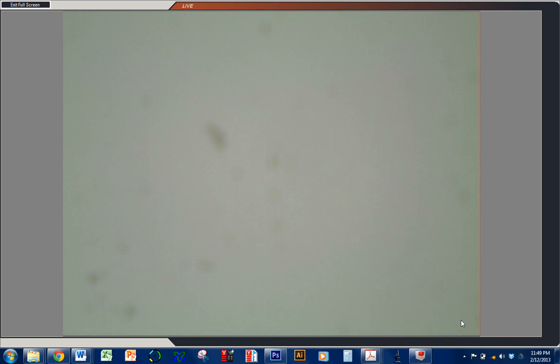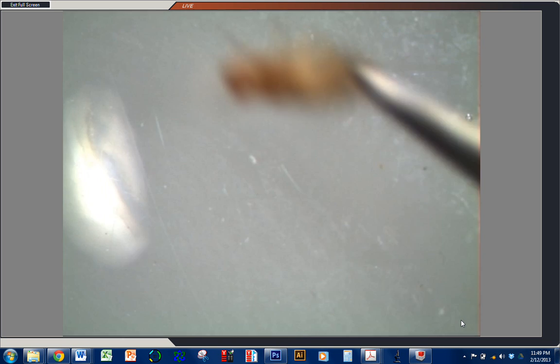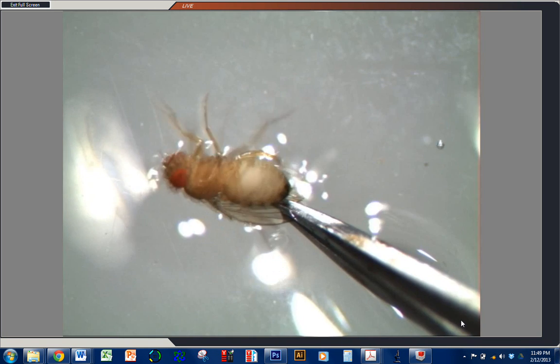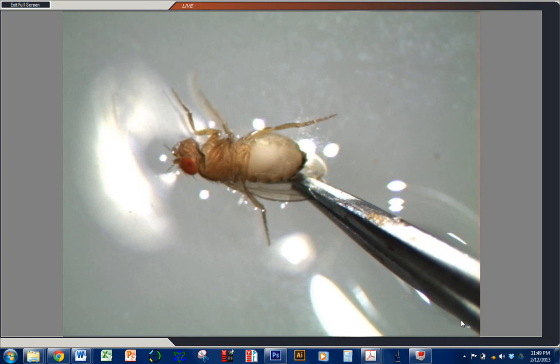The first thing you need to do is get your microscope and set a depression slide on it, add a little bit of PBS — we put 0.3% Triton in it to break the surface tension a little bit — and here comes our female Drosophila straight off our CO2 pad.